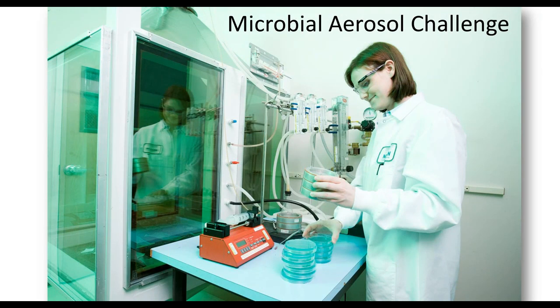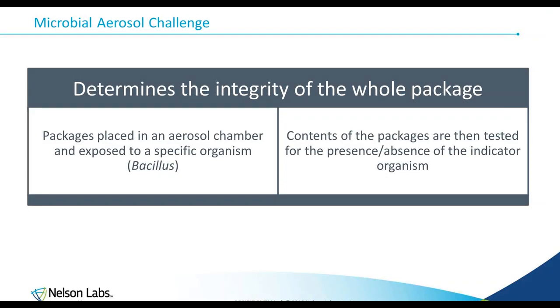If you have a non-porous package, such as a poly pouch, we can do the microbial aerosol challenge. These packages are placed into an aerosol chamber and also exposed to that same Bacillus atrophaeus. The contents are then tested for the presence or absence of the indicator organism.